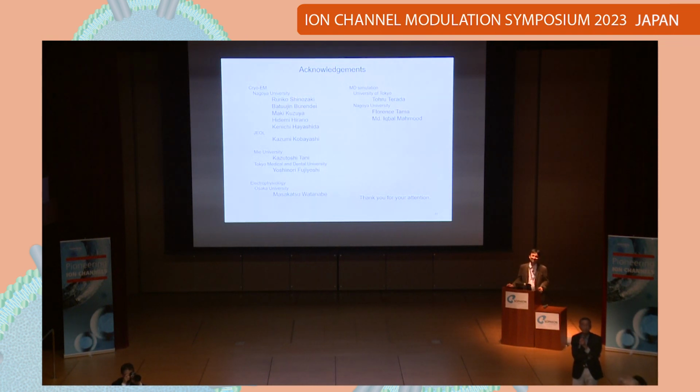Thank you very much for the wonderful talk. My question is, did the lipids found in the structure come from the native tissue in the heterologous expression system, or when you made the nanodisc, I think you added POPC. So was the POPC added during nanodisc formation shown in the structure? That's the first question.